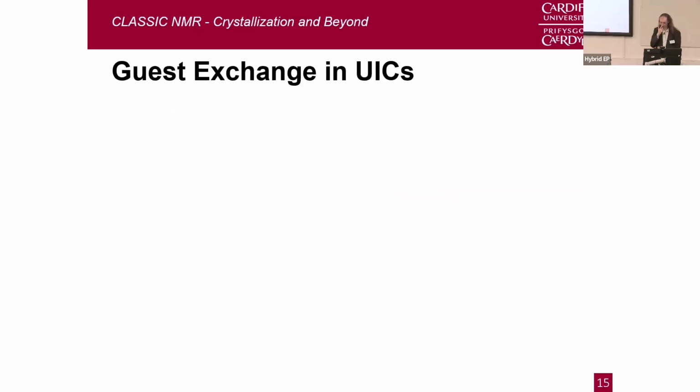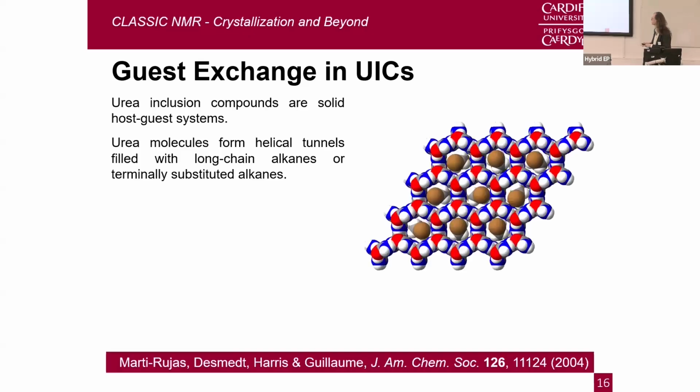So the next topic that I want to look at is something that my group, I work with Kenneth Harris, has been looking at for a very long time: urea inclusion compounds. And in particular, one of the interesting properties that these materials have is that they can exchange a guest molecule that's sitting within a rigid host structure.